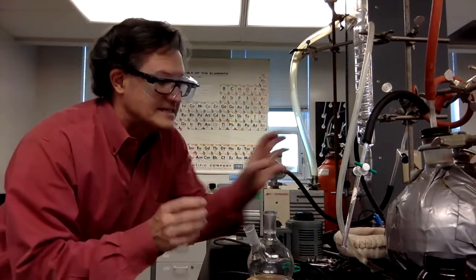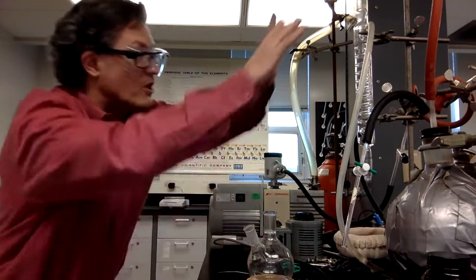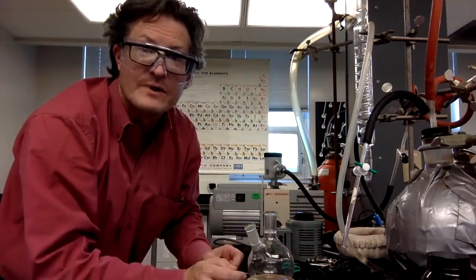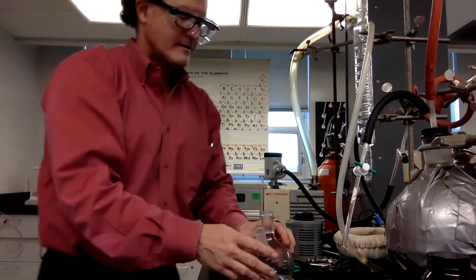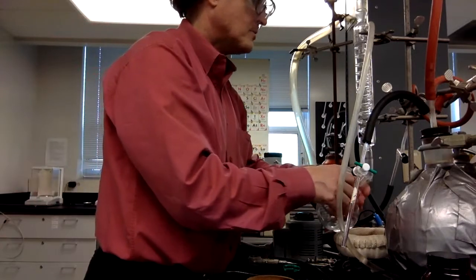It's great at making a seal, but it can also get some of that dust stuck on there. And we don't want any of that dust sticking on there, because if the dust sticks on there, it will stop the vacuum seal. We already tested everything. We know we don't have a leak, but we could cause a leak if we accidentally get dust on there. All right, so we got some boiling chips in there. Got this. We'll put it back together.